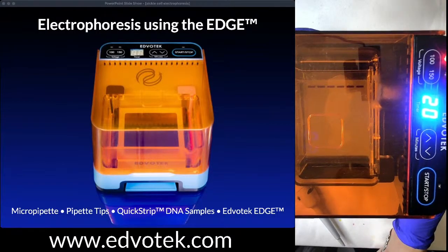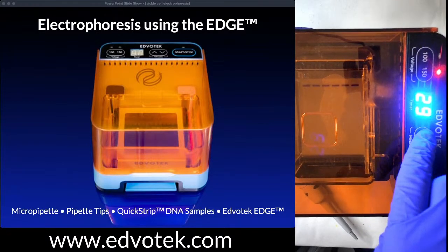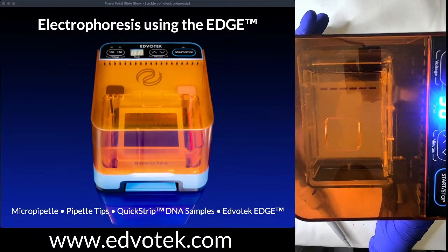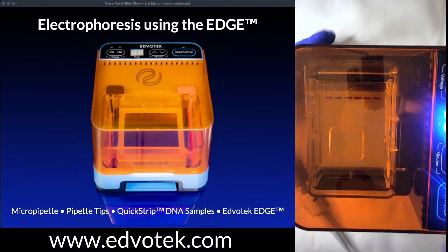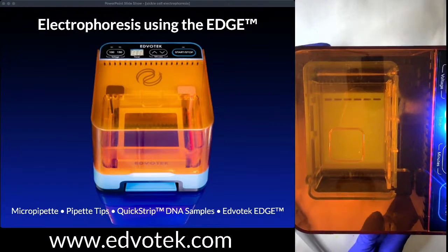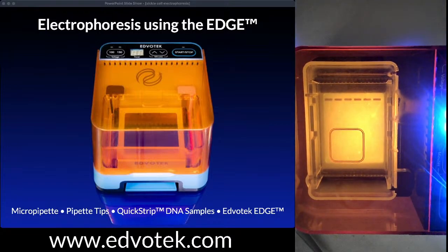So I'm going to run it here. I'll show you what I'm programming, 150 volts. I'm going to set it for 30 minutes. We shouldn't need that long, but I just want to keep it running while I'm talking, in case I talk a little long, which you all know I sometimes do. We'll just make sure the gel is running the entire time. And I'm going to hit start, and we're going to go. I'm going to turn the light on as well. And I'm also going to turn off my extra light so that we can see our bands as they're separating in real time.